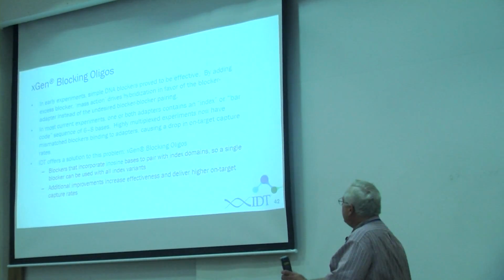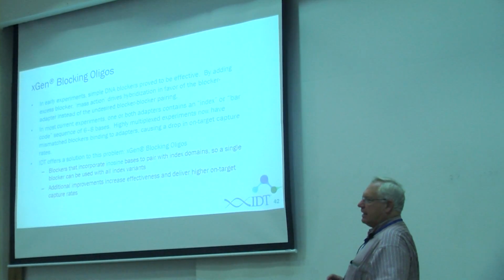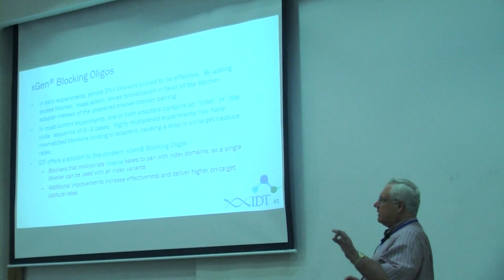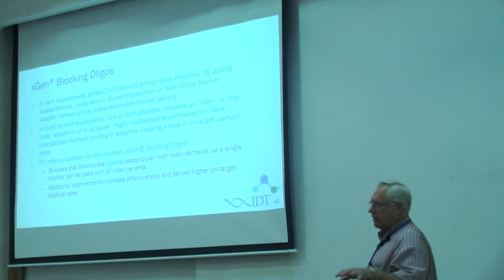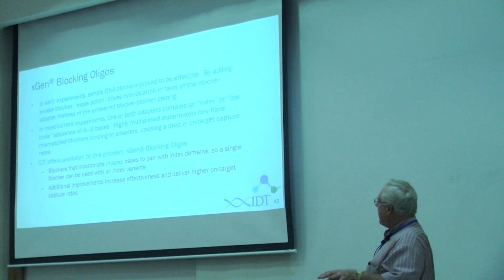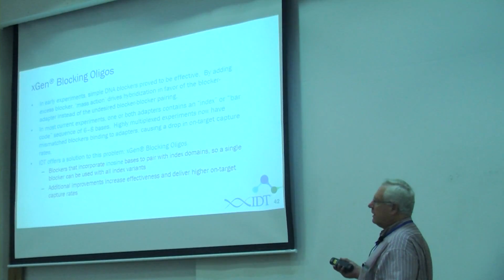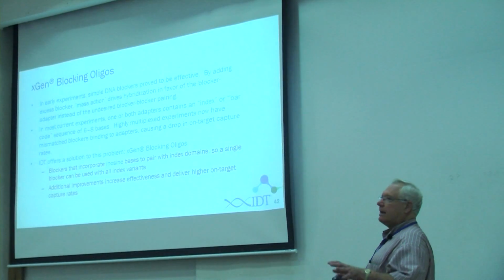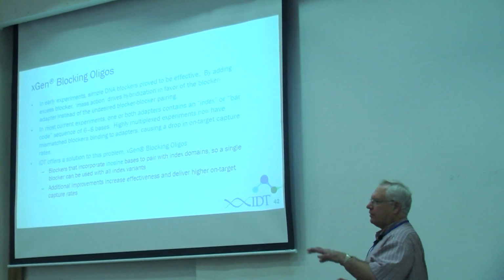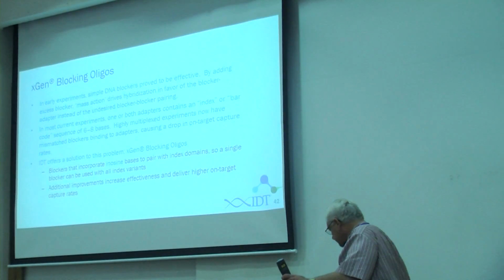So we tried to stop that by creating a new version of blocking oligos that had two different chemical changes in them. One is that we don't make a barcode specific for a barcode anymore. We put an inosine region there that's going to be good for any barcode. And then we put in TM enhancing chemical modifications into the arms. And as a result, the blocking oligos now will hybridize and bind to the adapters before adapter can bind to adapter. And it can totally block the daisy chain.